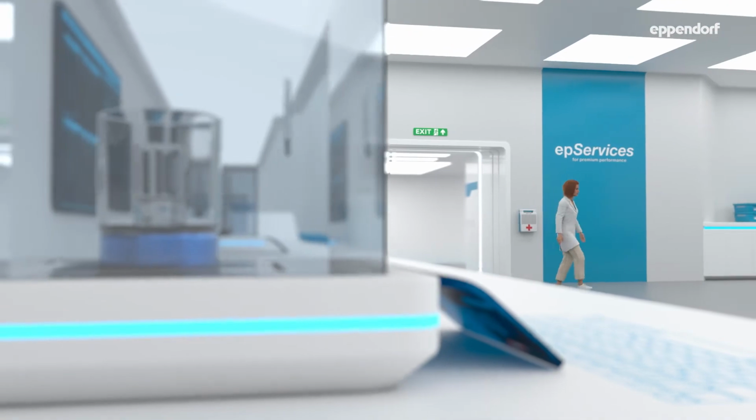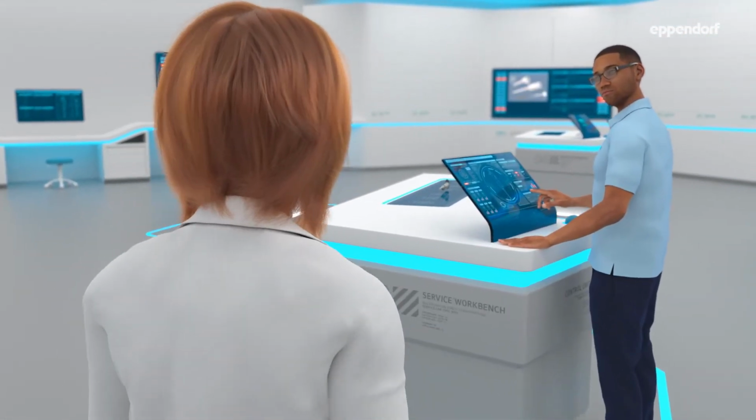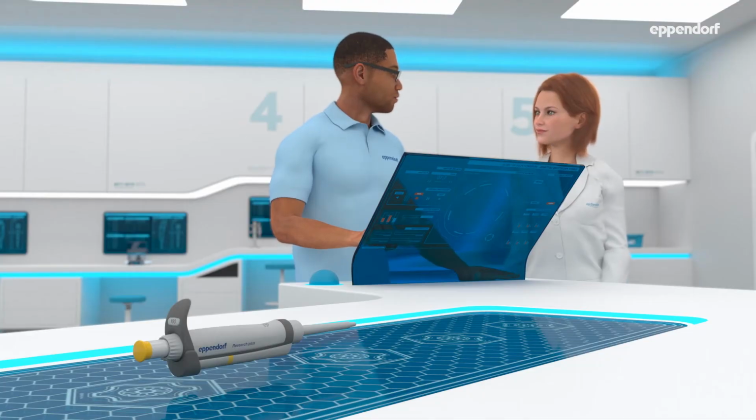Hello Tom, can you demonstrate a maintenance procedure for our guest? Hey Sarah, yeah, of course, I'd be happy to do so. Great, I actually just started with the service of your Research Plus pipette.